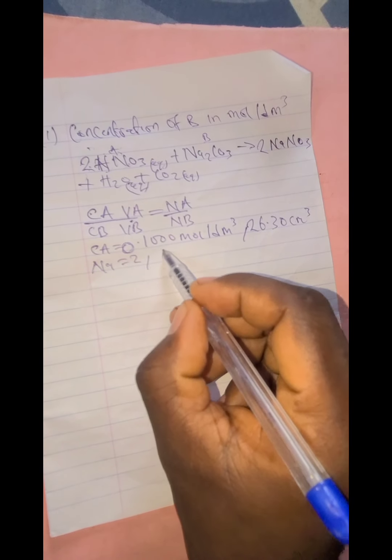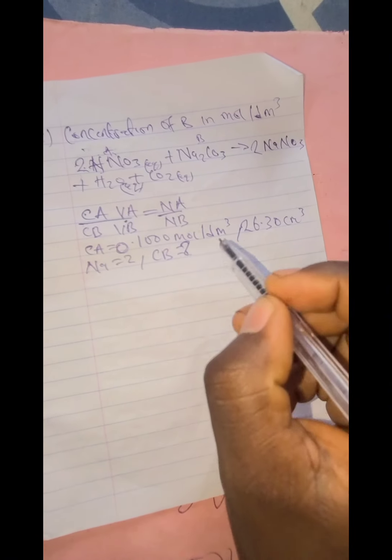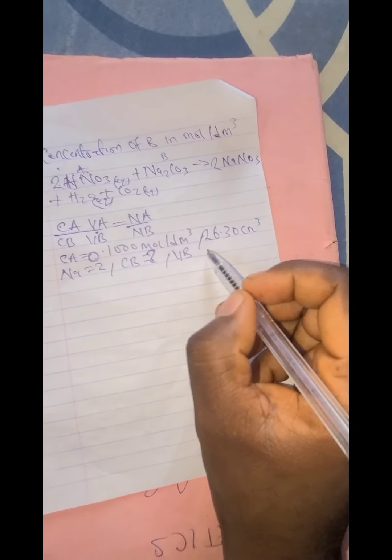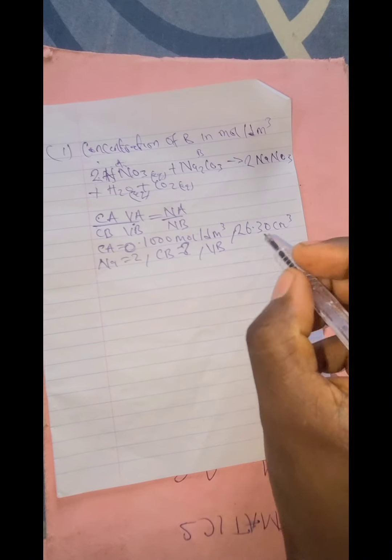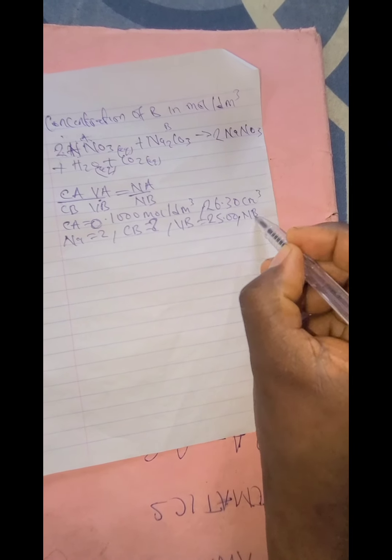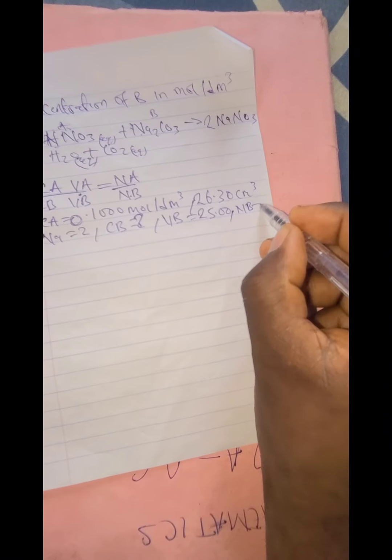Then my Cb, concentration of B, is what I'm looking for. My Vb, volume of base, is your pipette, the pipette you use to pipette your base. We are asked to use either 20 or 25, so I use 25. Then my Nb, number of moles of B, is 1.